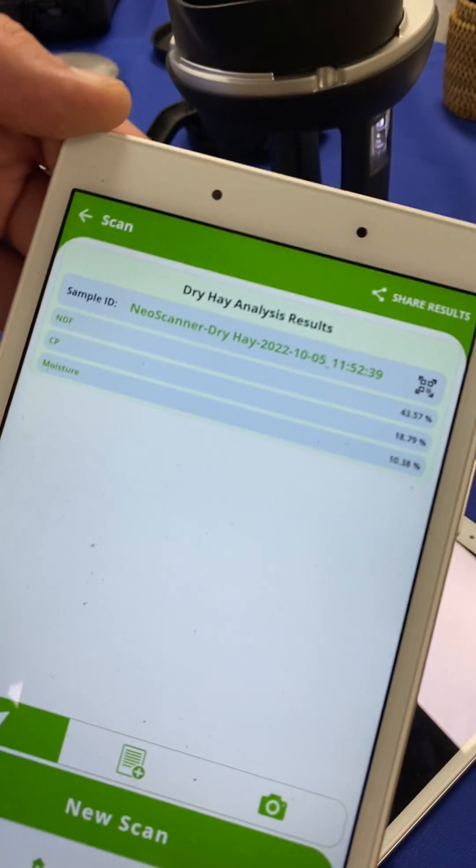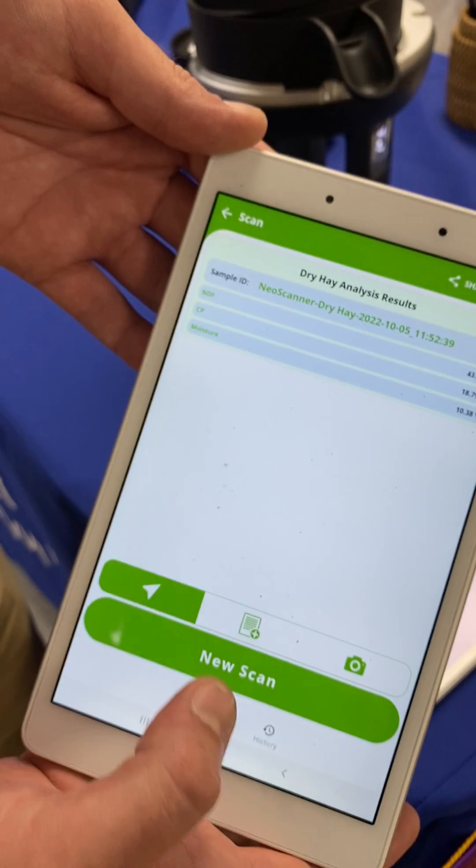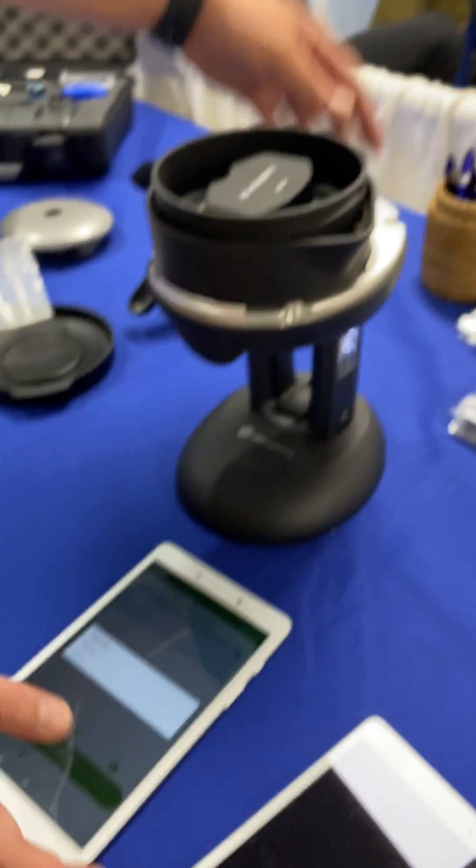There it gives you your results, and here we can see that our geotag location is enabled so that will pinpoint where we are taking the scan from. You can also take pictures of your sample.